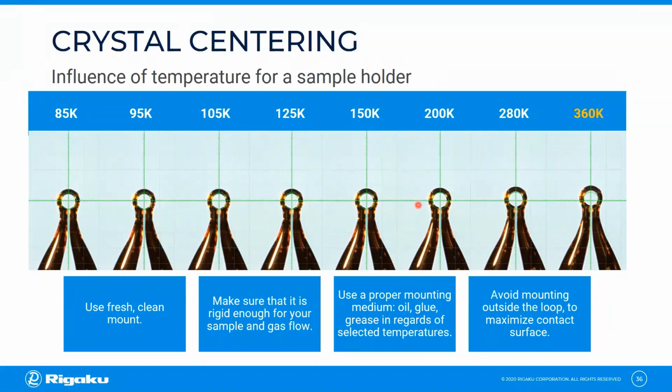So if you keep your crystal in the full width and height of your beam, which for Synergy-S, the new generation of the system, will be around 110 micron, you will see that this small offset will not be a problem for CrysAlis Pro to handle as a wobbling or eccentric crystal. But if you decide to use a hot blower or other temperatures, those sometimes will change a lot, as you can see. And then if the crystal is small, that can influence your results, especially if you're planning to check if you're observing changes in your cell dimensions.